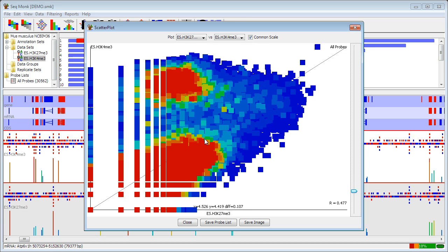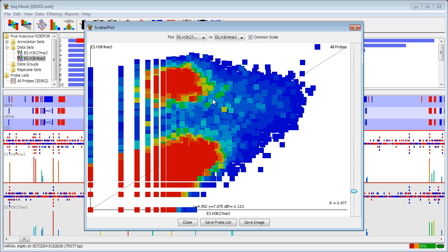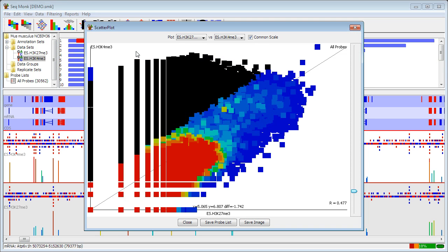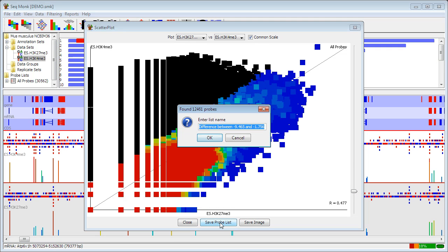So if I want to select those I can just drag in this view and save a probe list from there.